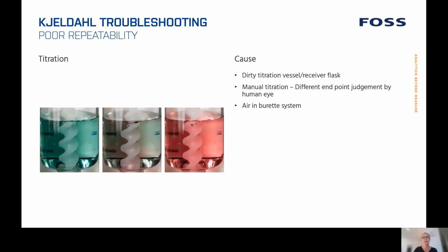Poor repeatability in the titration step. Check the titration vessel so it's clean, or the receiver flask. If you have manual titration, the reason could be the different endpoint judgment by different operators, or it could be that there is air in the burette system.